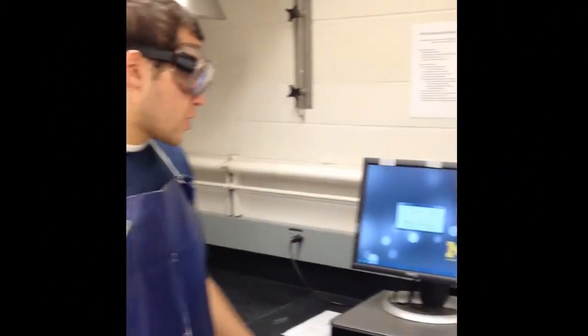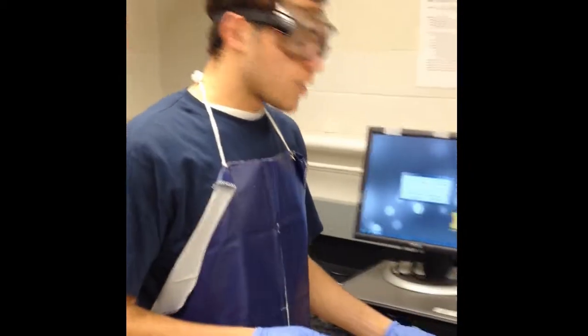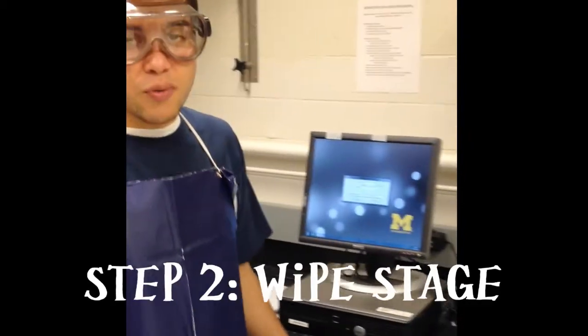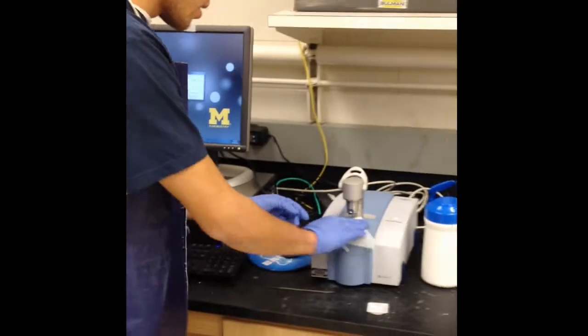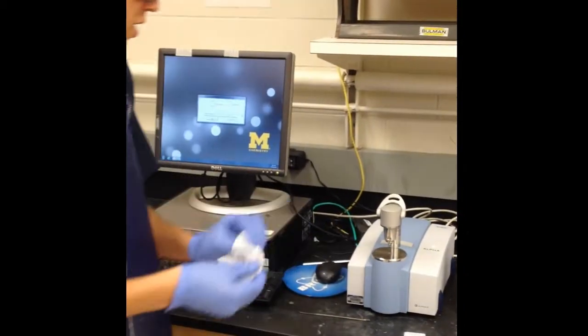We've come over to the station now where we're going to run the infrared spectroscopy. What we need is a microspatula in order to get the compound onto the surface. The first thing you should do before you run the infrared spectroscopy is to always wipe the surface with a wipe. This is just going to ensure that you get the compound that was used by someone else off of the surface and to make sure that your results aren't skewed at all.